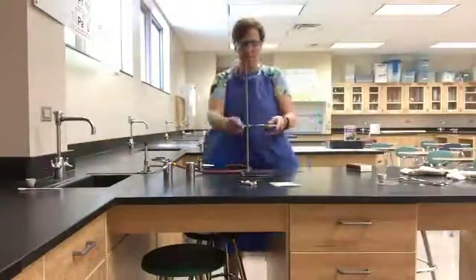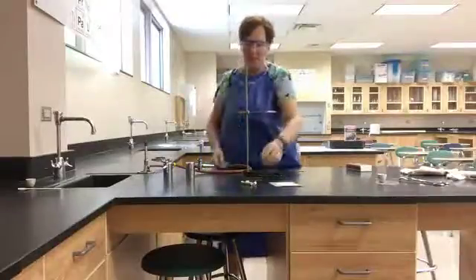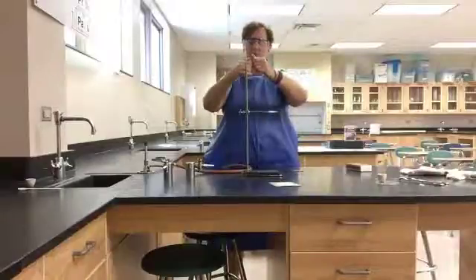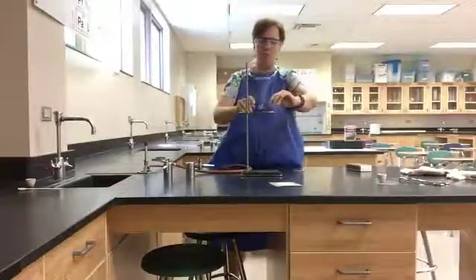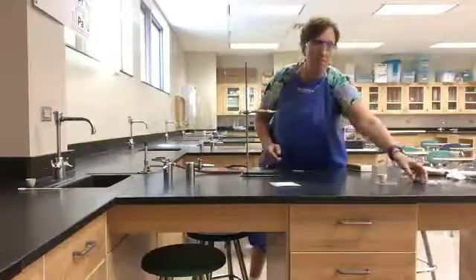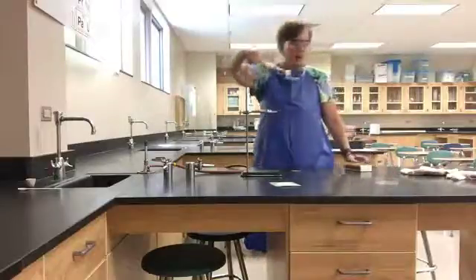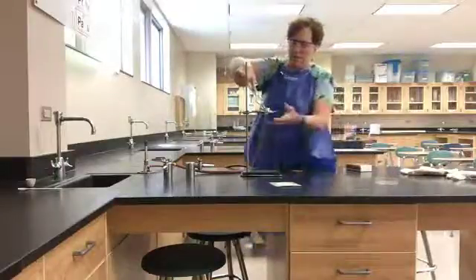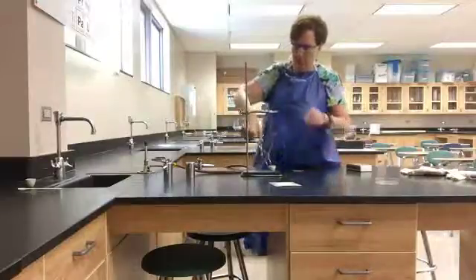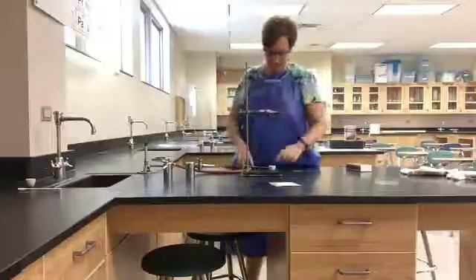Take your ring stand and put a ring on it. Then take what I call a clay triangle — it's pliable, so you can make it smaller or bigger. Put it on the ring, then take your crucible with the hydrate and place it on the clay triangle.